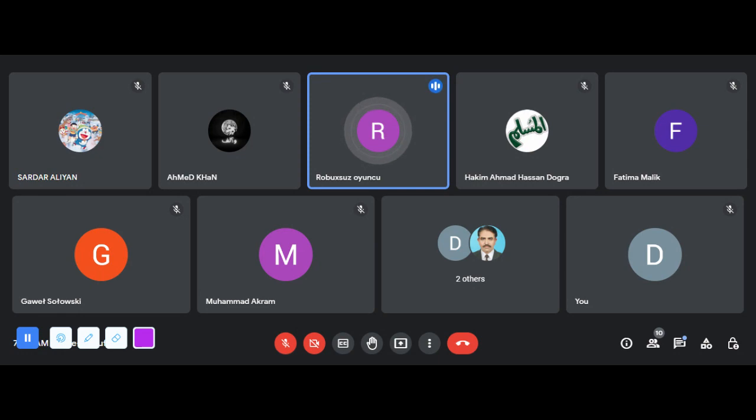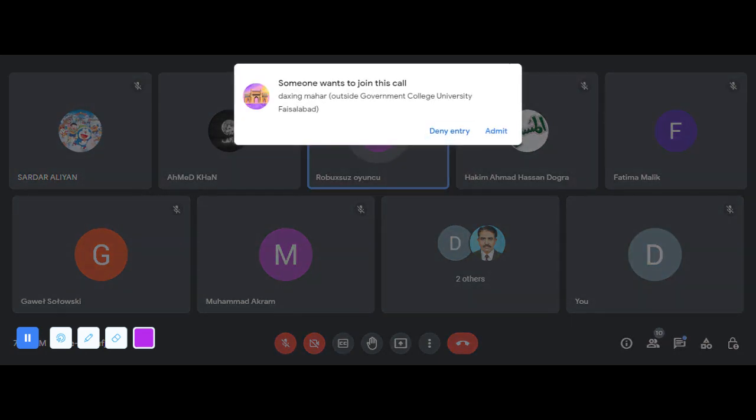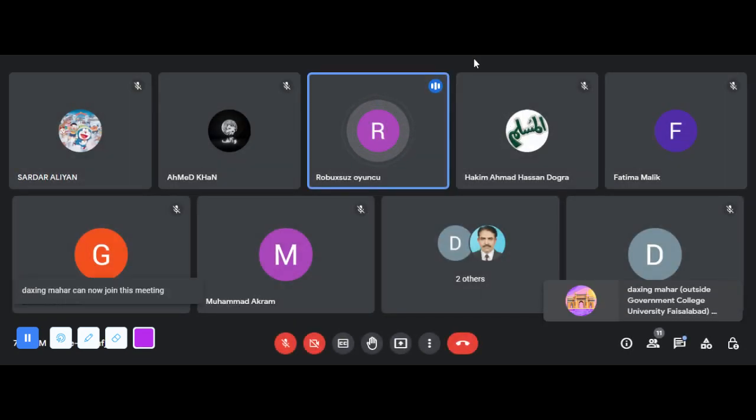Also, we use this in clinical research, like antimicrobial and anti-cancer activities. We use many gram-negative and gram-positive bacteria in the research. These microorganisms are pathogens for humans and other living things. We investigate minimal inhibition concentration and the disk diffusion method for antimicrobial activities.